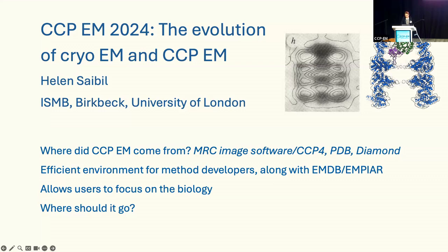It was fun. So now with CCP-EM, you can really focus on the biology. You can really think, what are the interesting problems, or what are the interesting methods I want to develop? And it's all there. For a biological user, you can kind of press buttons and things just happen. A lot of things just work. And as you heard, the developers are really trying to make it so that things work more automatically and more easily and do all the technical things we need so that the users can just get on and focus on interesting biological problems or whatever they want to do.